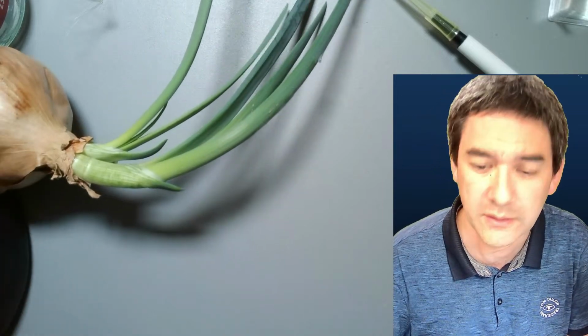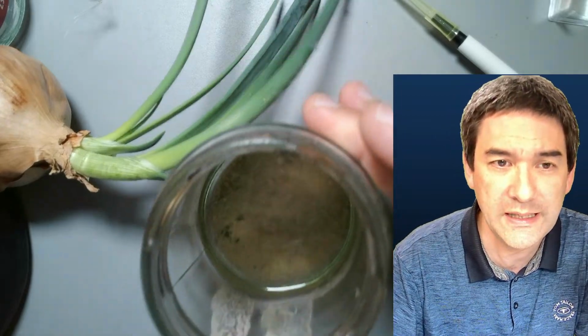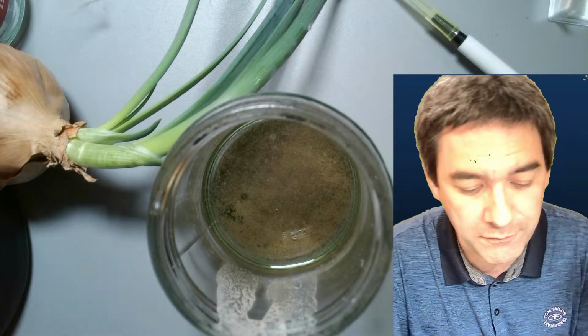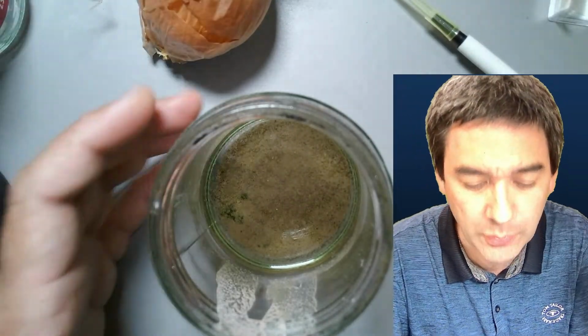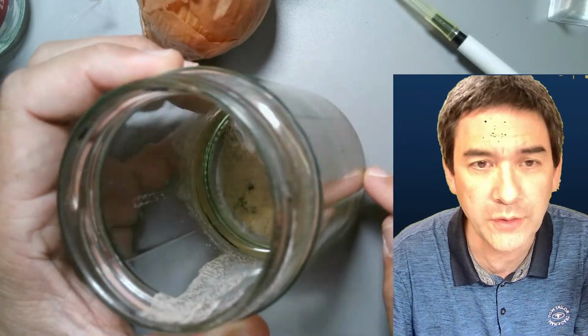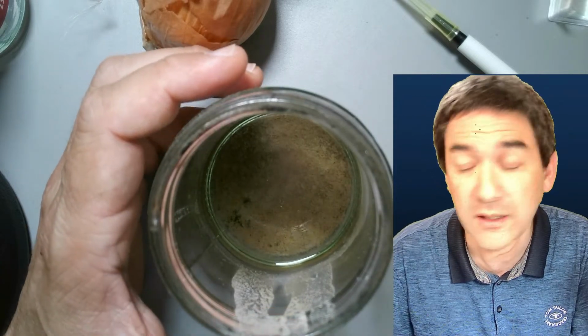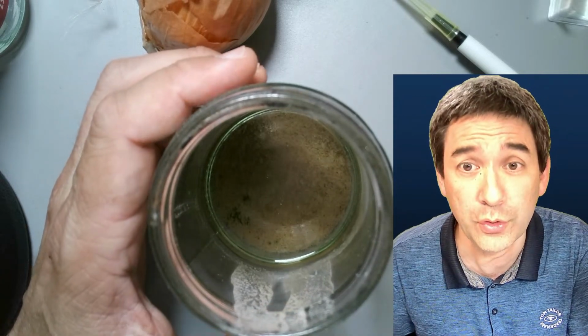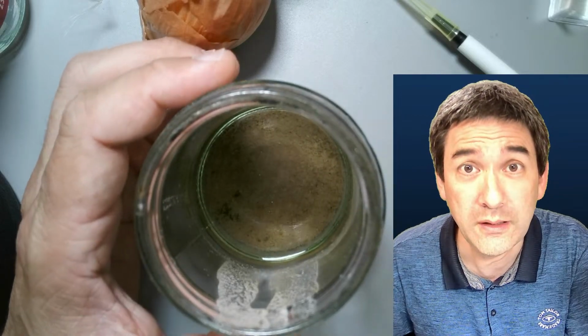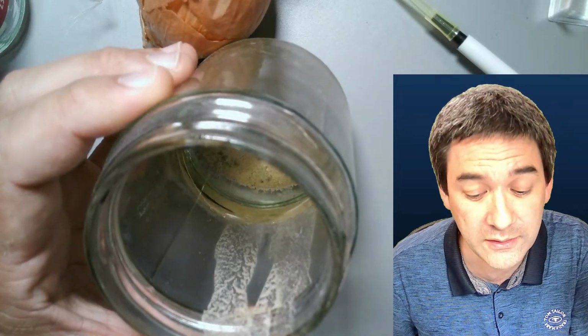Because I do also want to do a little bit of practical stuff as well, because many people are also interested in doing a little bit of practical microscopy. I would like to show you this here again. A couple of months ago we already looked at it. This is a seawater, saltwater sample with a lot of sand in the bottom, and I collected this two years ago from a beach in northern Germany. For those of you who speak German, the Wattenmeer. I was in northern Germany on holiday, and I collected this sample here.